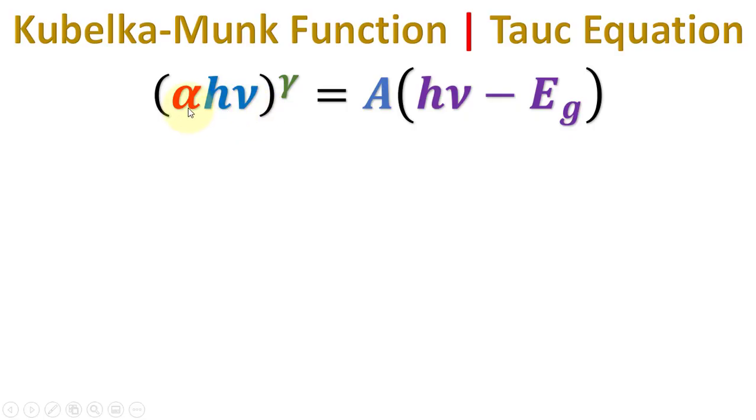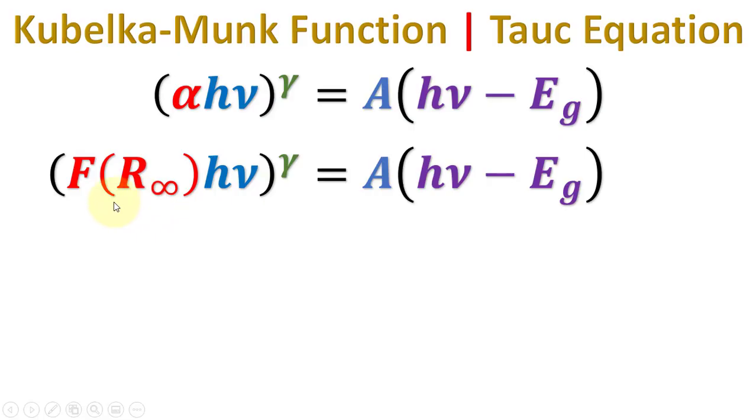This is the Tauc equation where alpha is the absorption coefficient. For the DRS data, we will replace alpha with the Kubelka-Munk function F.